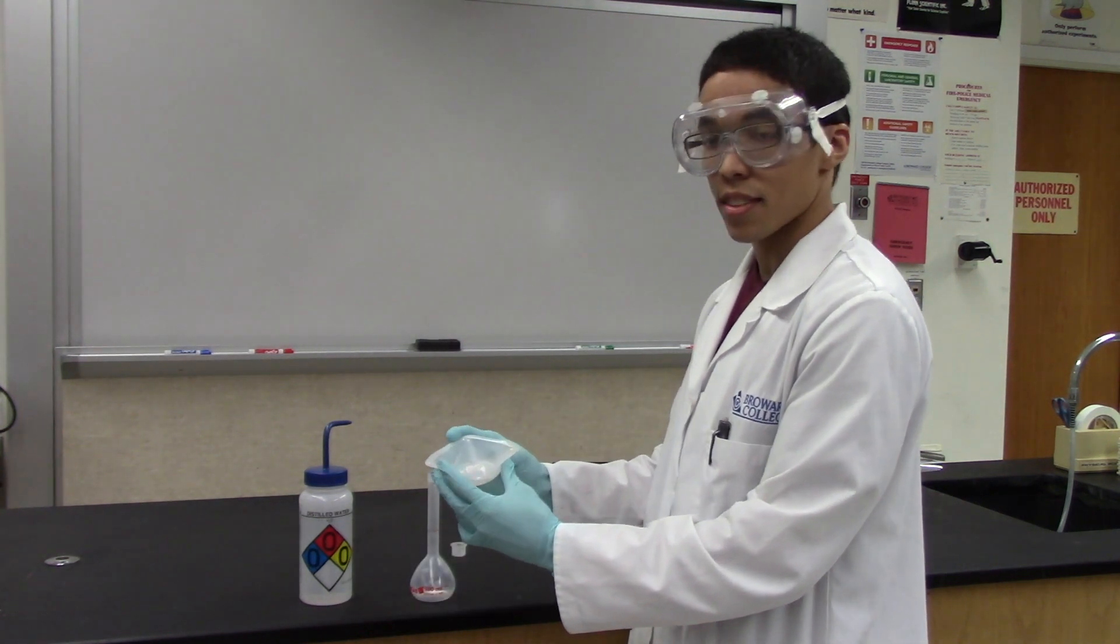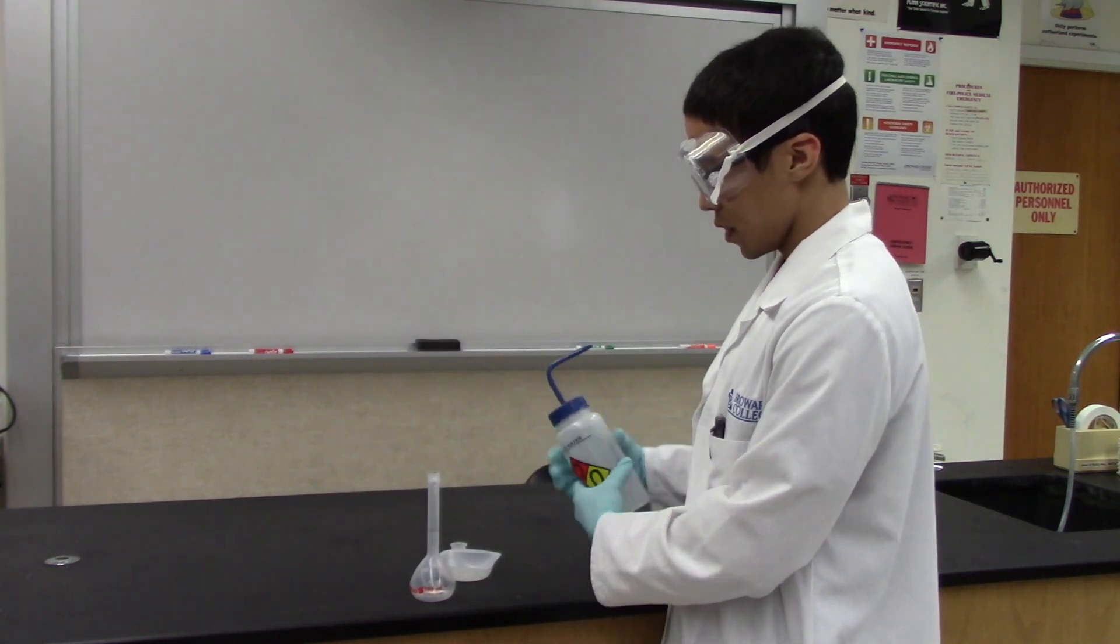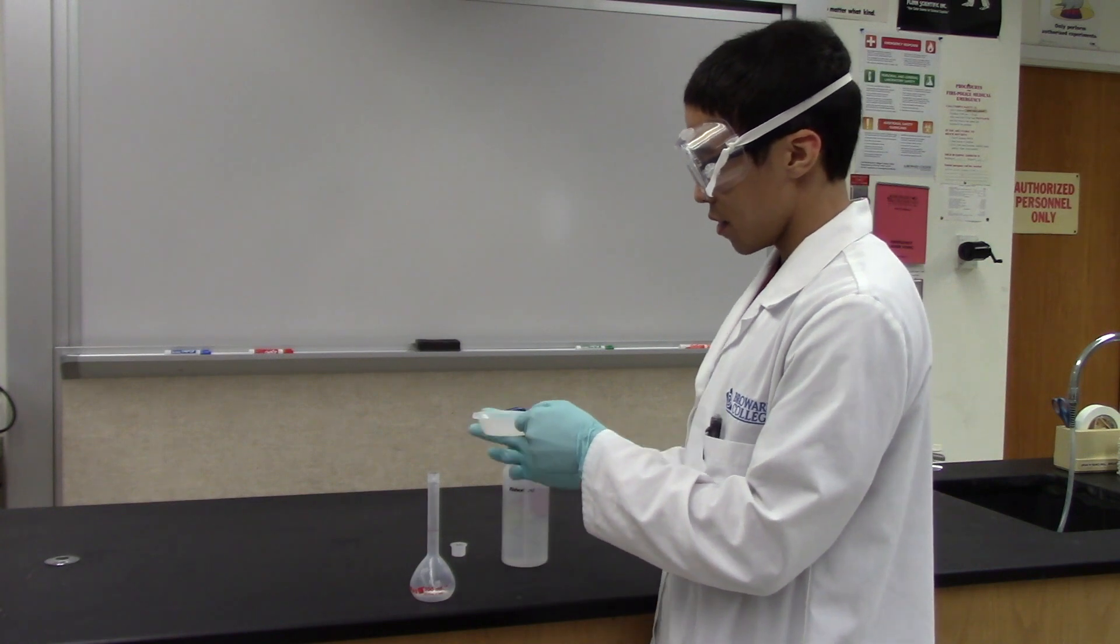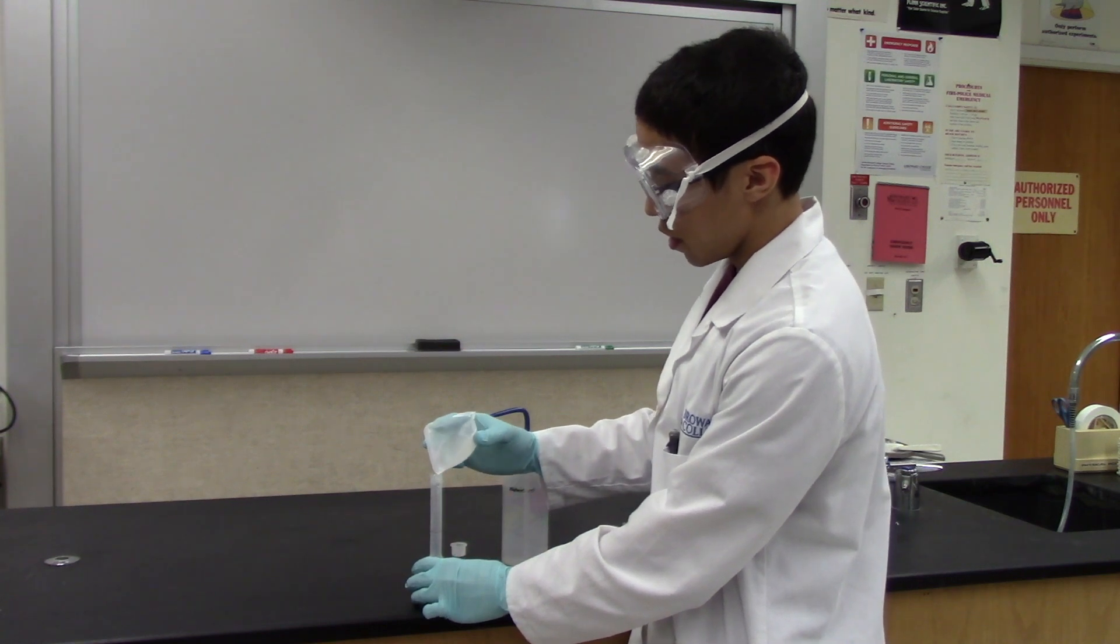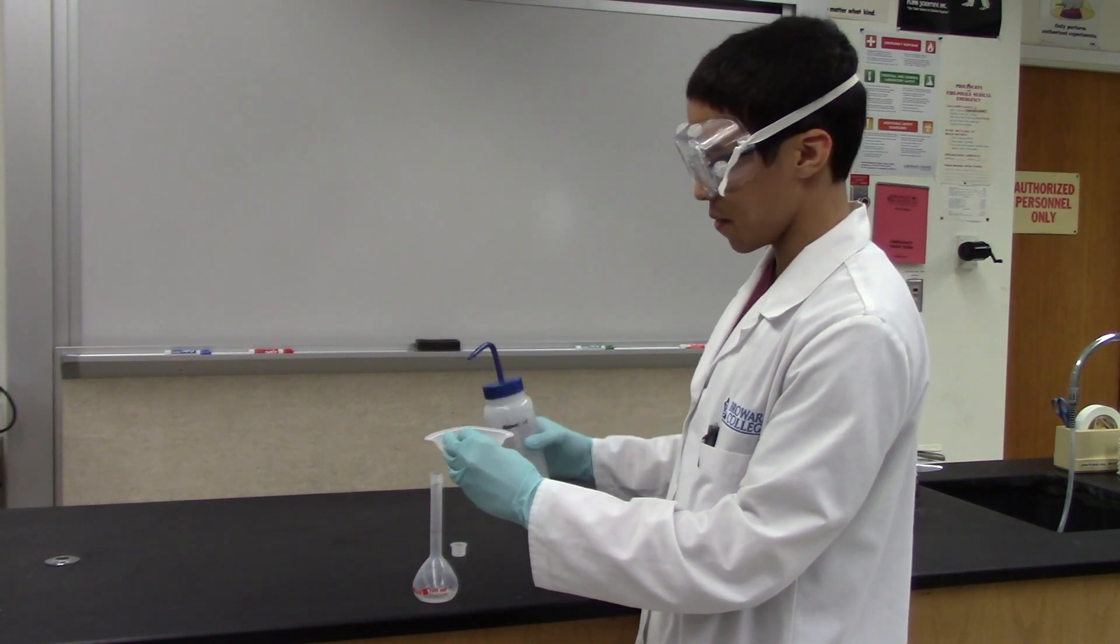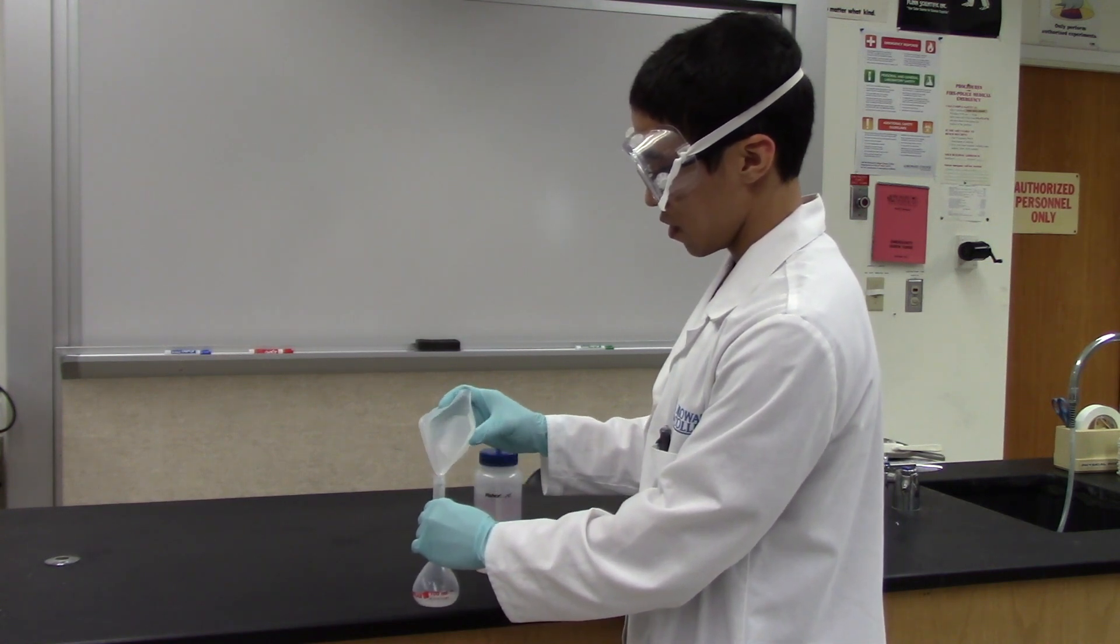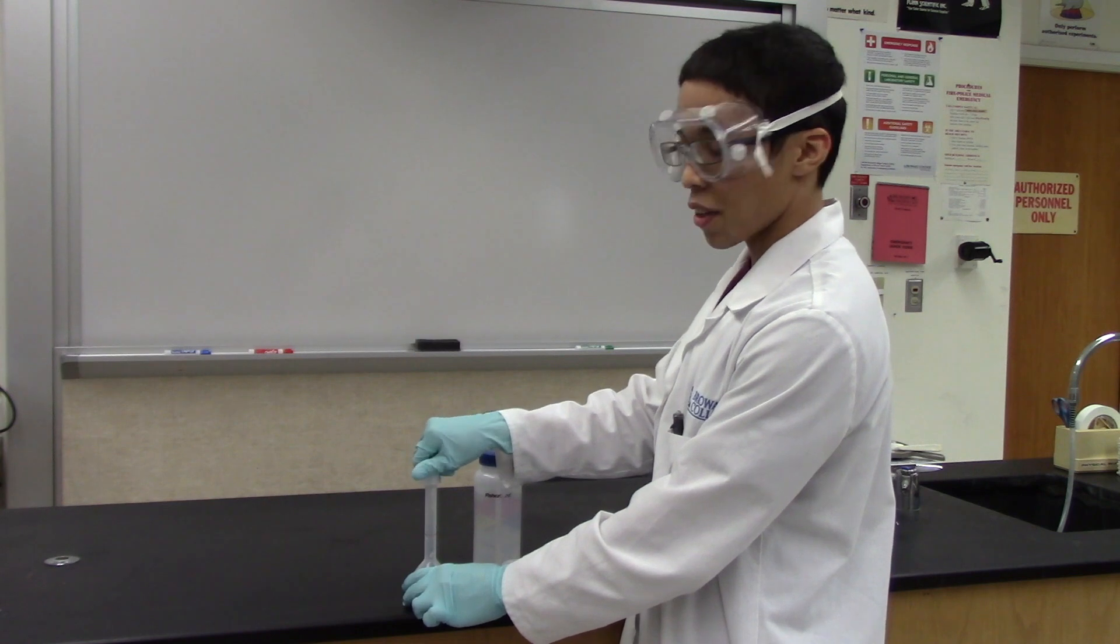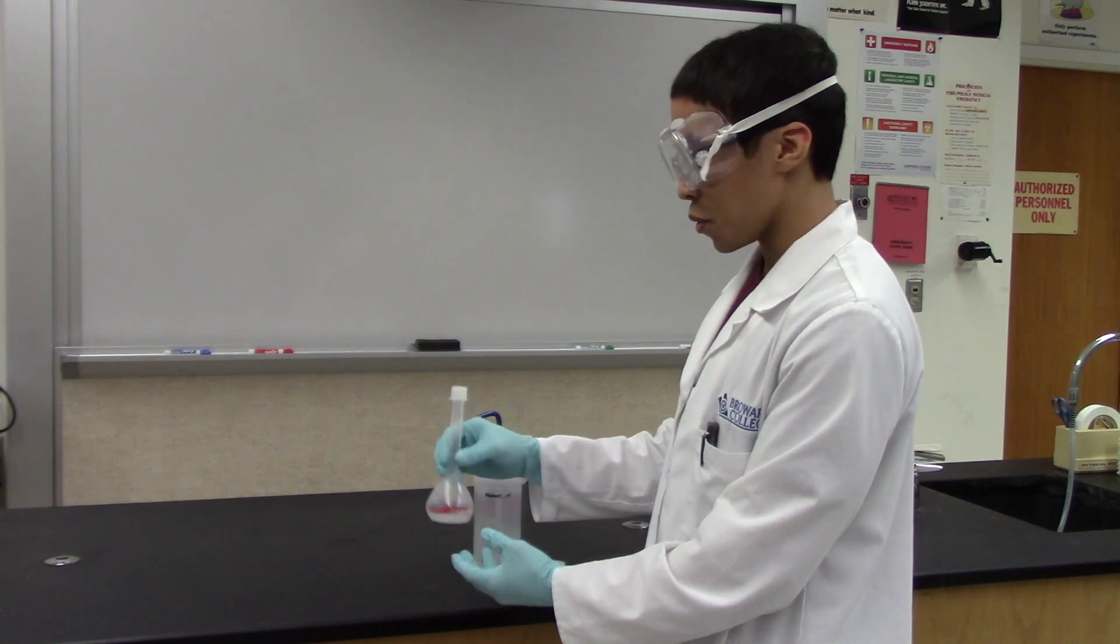Notice how some of the antacid tablet is stuck to the bottom of the weigh boat. You will use distilled water to wash out the weighing boat into the volumetric flask. Try to make sure you get every bit of it into the volumetric flask. More than one rinsing does not hurt. Once all of the antacid tablet has been transferred to the plastic volumetric flask, you will close the volumetric flask using the top and then you will swirl to dissolve.